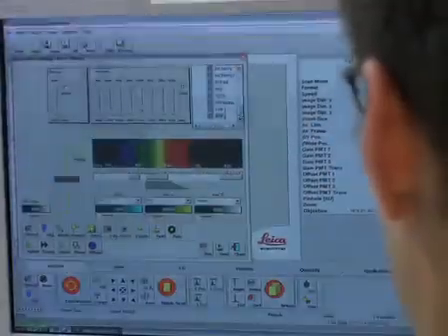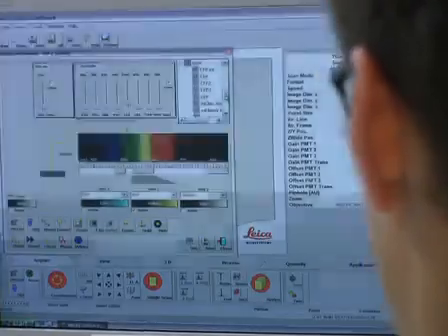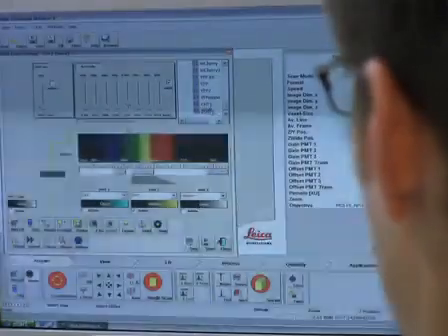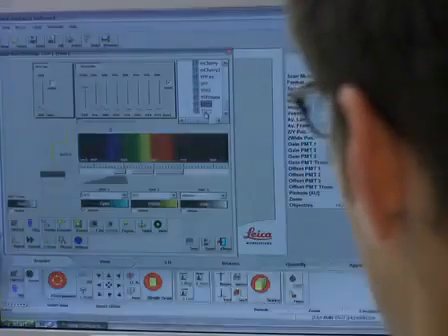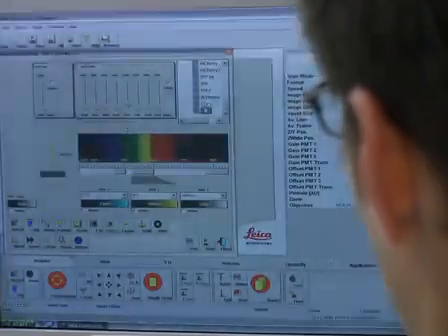Experimental controls are crucial to eliminate fluorophore crosstalk between the emission channels, as well as to evaluate expression issues and non-specific fluorophore multimerization. As such, single fluorophore transfections are utilized for setting up every image session.